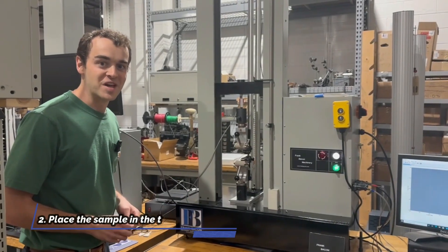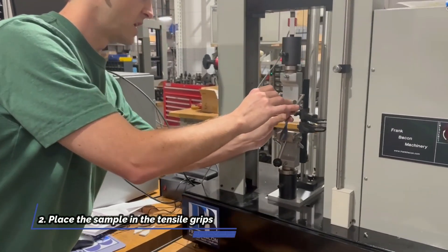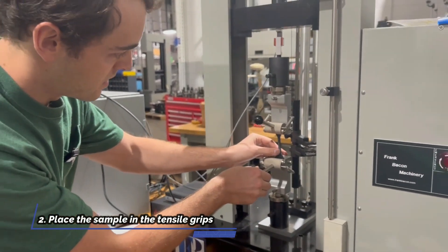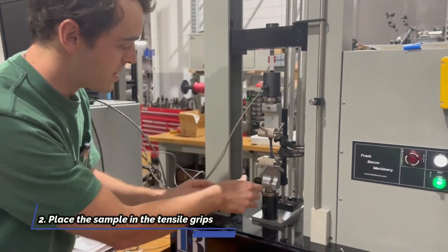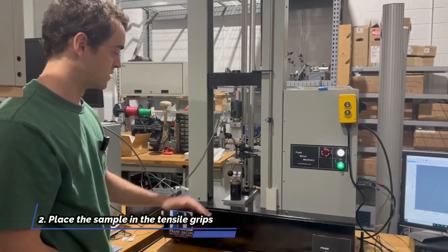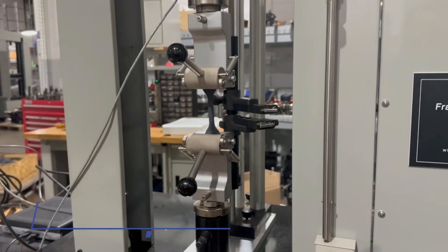Step two, we're going to load the sample up into our eccentric rollers. Now we can offer pneumatic action grips with these systems as well. This is a less expensive option with eccentric rollers and they typically are going to work just as well for these materials.